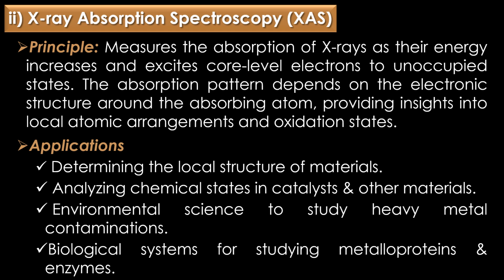Applications of X-ray absorption spectroscopy include determining the local structure of materials such as the coordination number, bond lengths, etc., analyzing chemical states in catalysts and other materials, environmental science to study heavy metal contamination, and in biological systems for studying metalloproteins and enzymes.